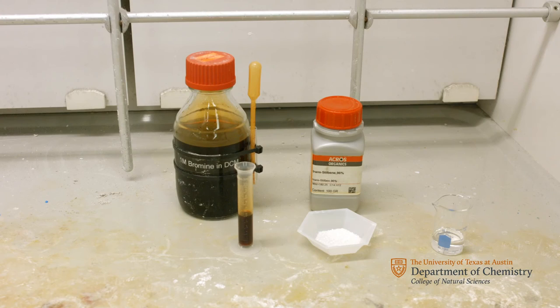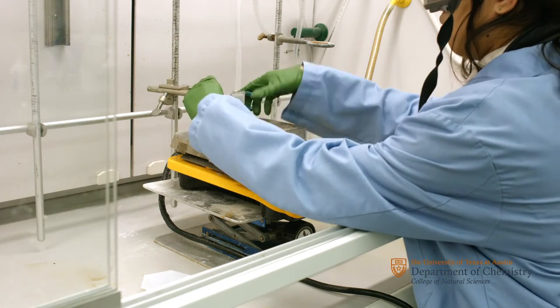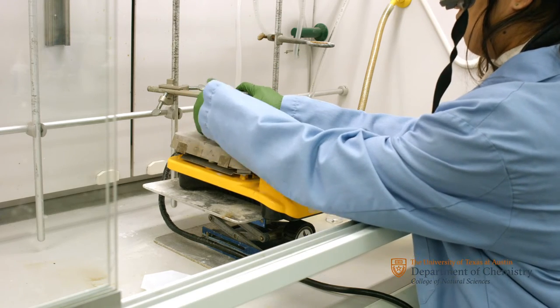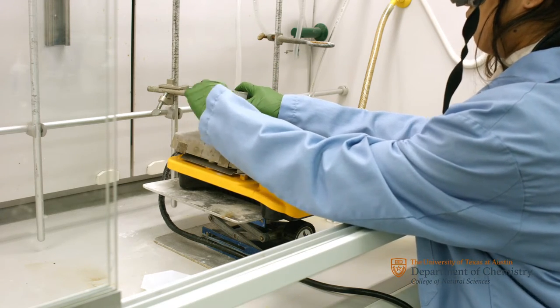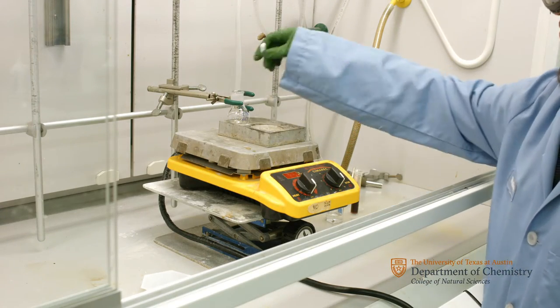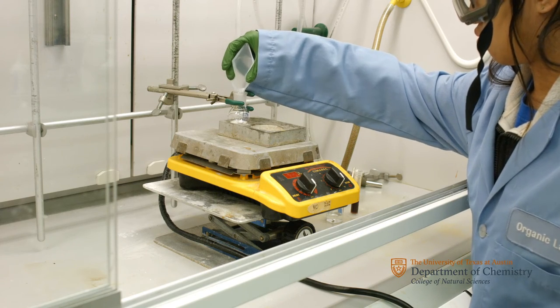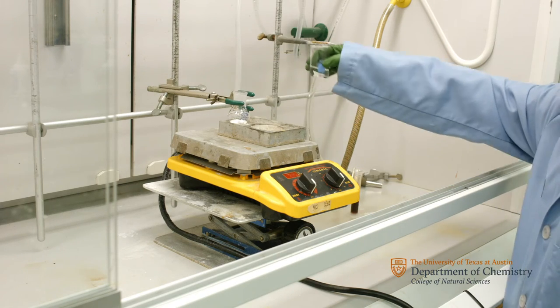To start, weigh out 0.9 grams of E-stilbene into a weigh boat. Obtain 5 milliliters of the bromine solution and 10 milliliters of DCM. Now place the 50 milliliter round bottom flask onto the stir plate, securing it with a clamp. Next, carefully add the 1-inch stir bar, the 0.9 grams of E-stilbene, and 10 milliliters of DCM.